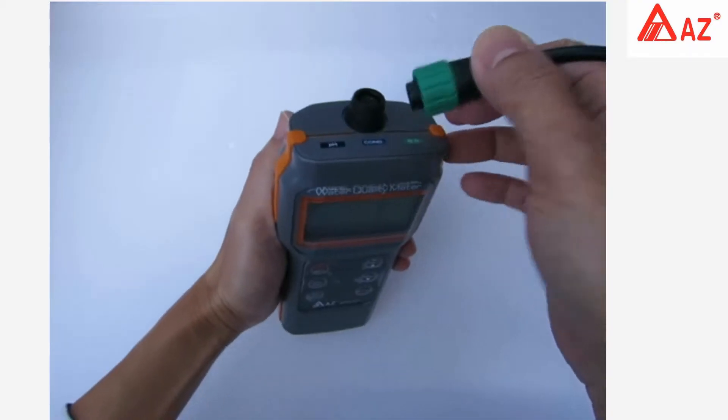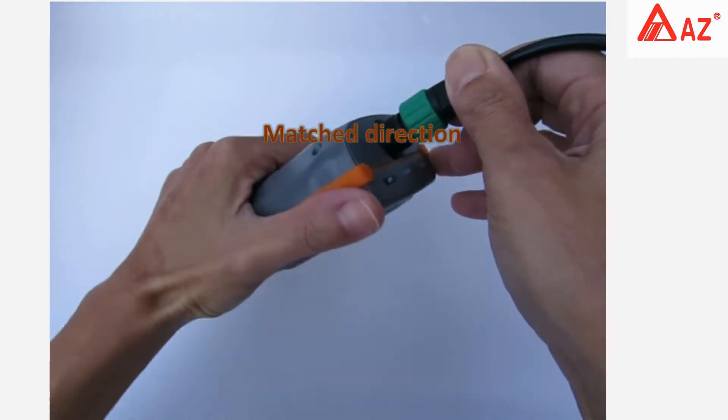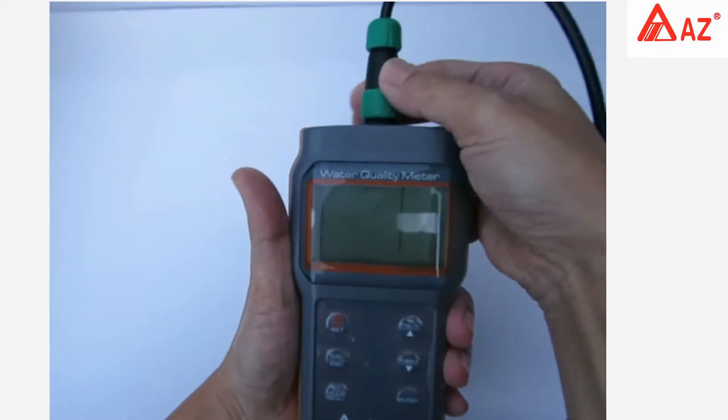Find the installation guide, match direction between plugs and sockets, plug in with the pin straight, and screw it in. Lock it down with the lock screw.